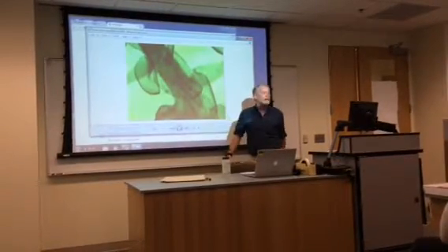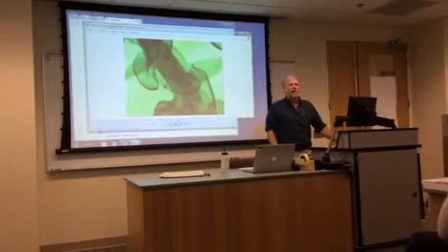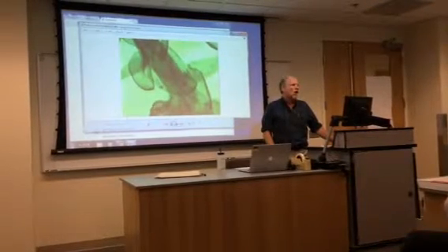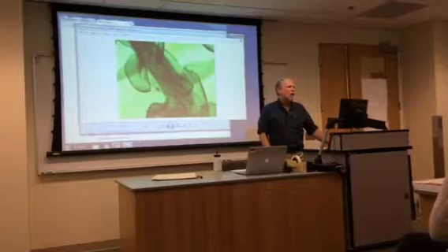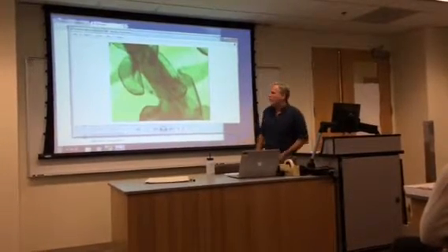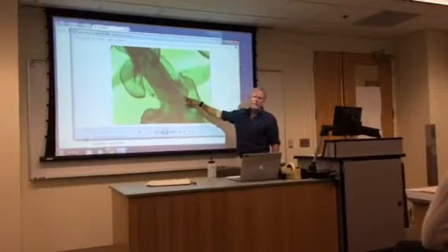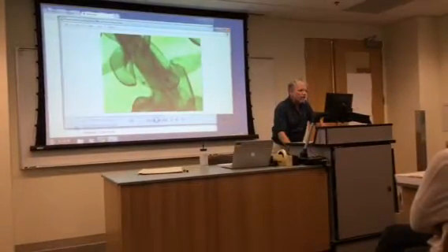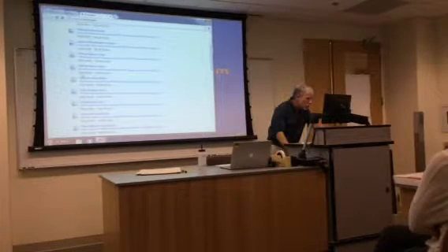Why would a plant make a leaf on the underside of the plant away from the sun? Stupid plant. It's for water. It's all about water in the bryophytes. So it's going to help absorb water from the substrate and then move it along the plant. Okay, so know these guys vegetatively.